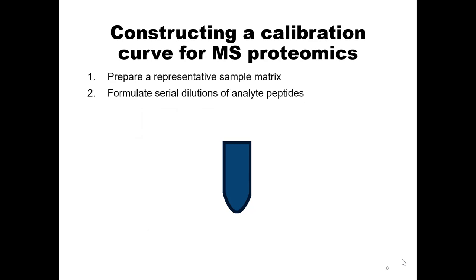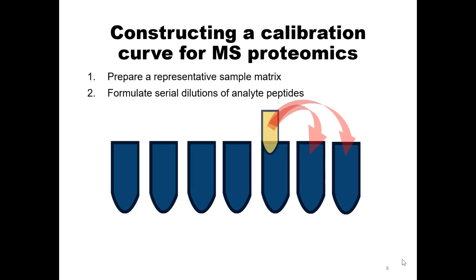An important note is that you have to have enough of your sample matrix to be able to span the different points of your curve.